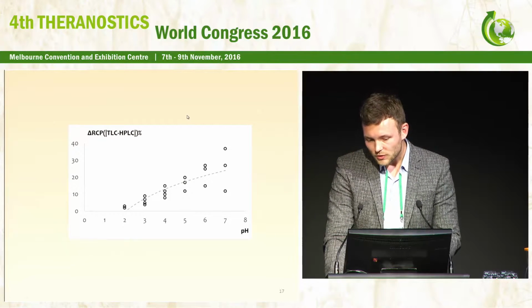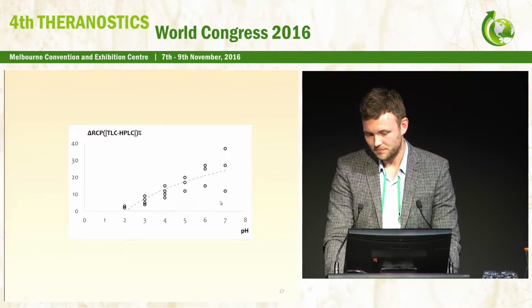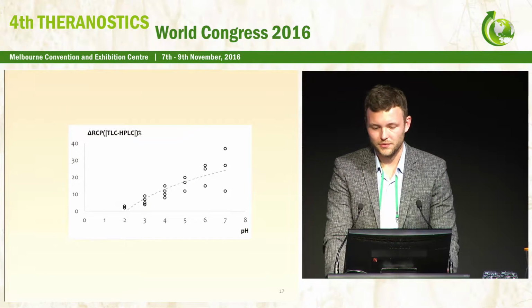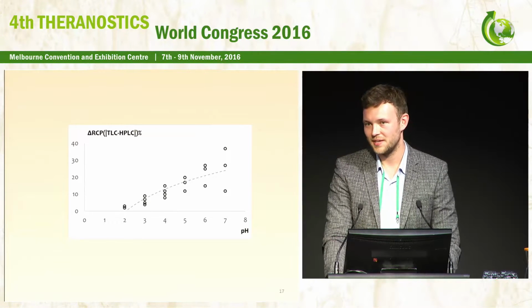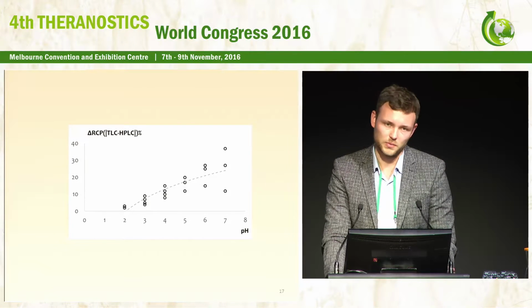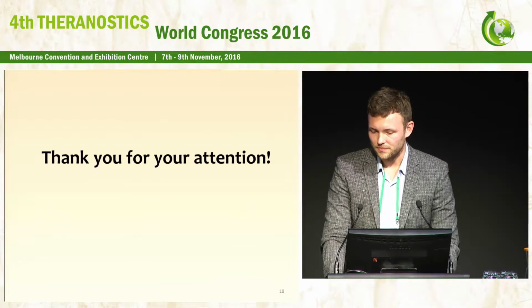But you see, something strange can be seen here, and I think it's important to take it into account, especially when you do research and development of new drugs, because sometimes in good papers you can see that the labeling efficiency was carried out only with HPLC. So, thank you for your attention.